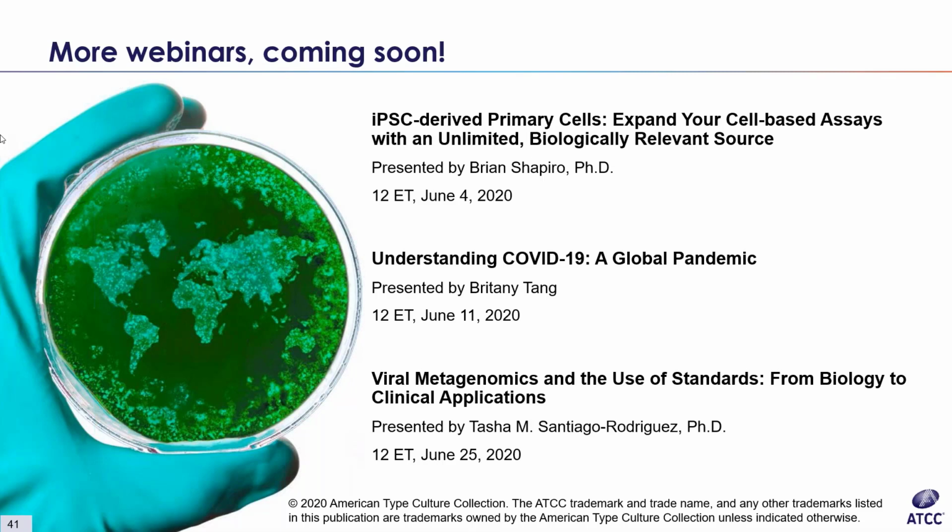Yeah, I would agree. I feel like we check expression by Western blot, but I am not entirely sure of that myself. There are conventional ways of doing it, like Western blots and so forth. But as far as the best way and what to expect, we can get more information on that.